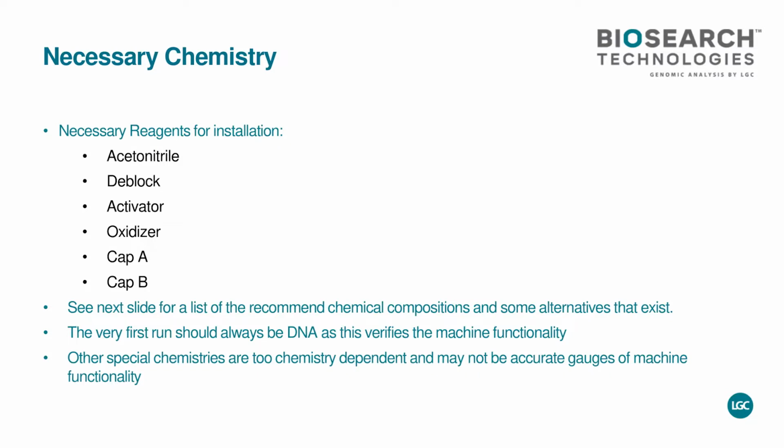In the process, of course, there are some ancillary reagents, necessary reagents. You need acetonitrile, deblock, activator, oxidizer, Cap A, Cap B. In the next slide, I will give you some idea of the composition of these reagents.